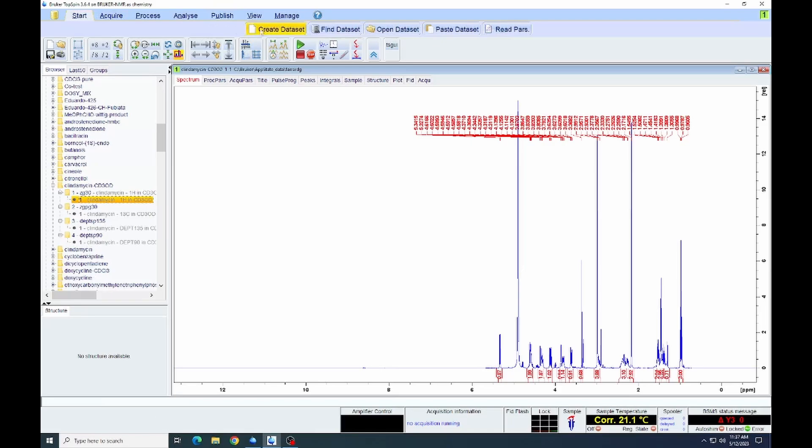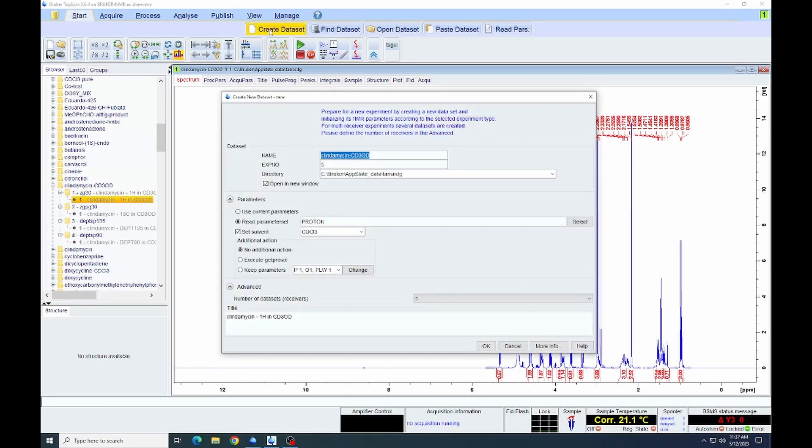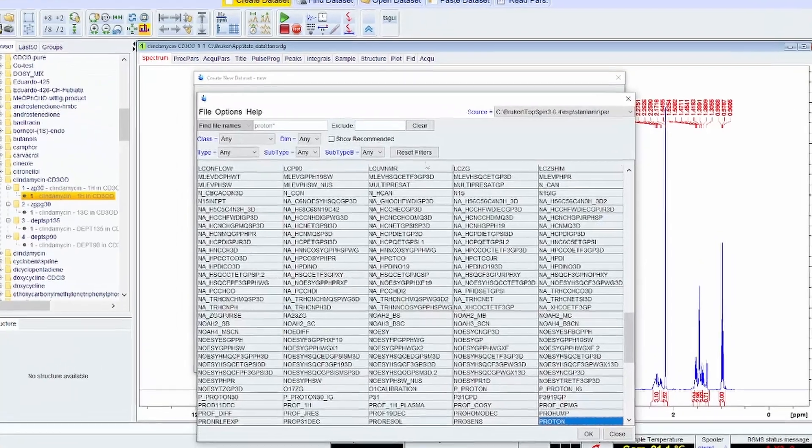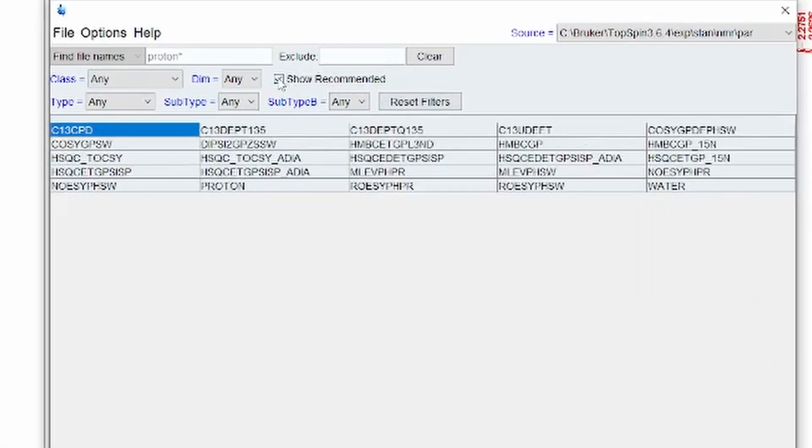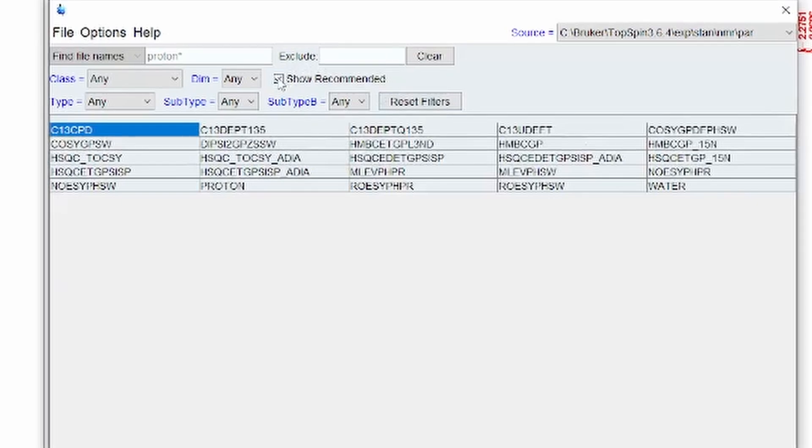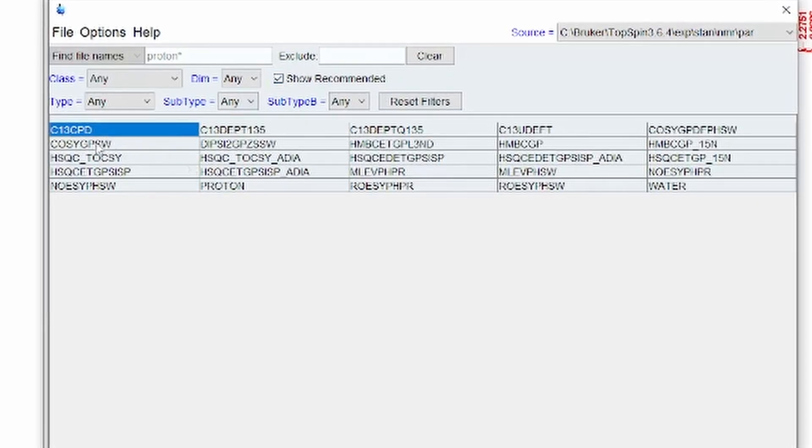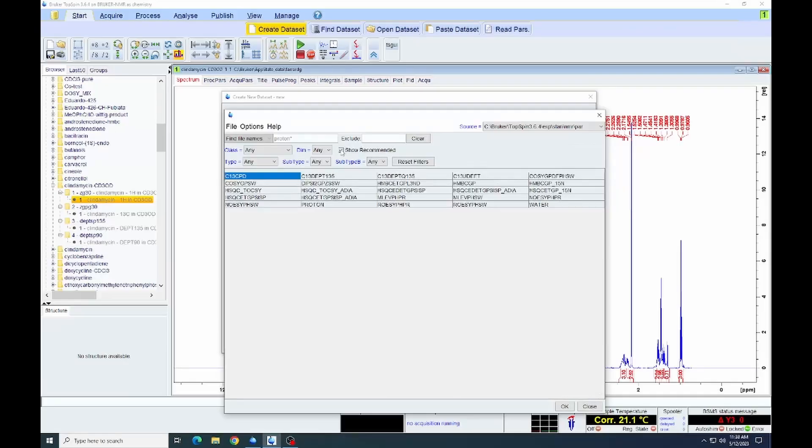We're going to create a dataset that gives us the window here. We are then going to select a parameter set. When we click on that, we get here a long list. We can click on that checkbox show recommended to get a shorter list of recommended parameter sets. And from that, we're going to select the COSY GPSW.